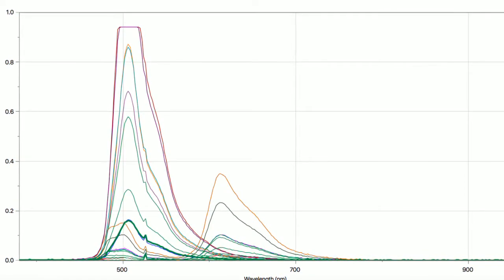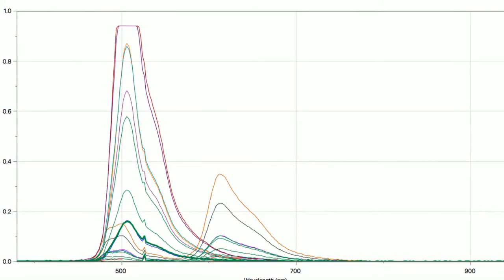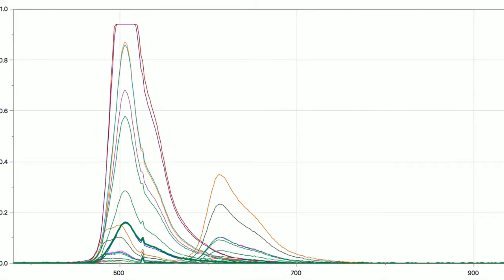The green had the highest intensity peak, and that is why it died first, as it emitted energy quicker. The mixed, when the intensity of both peaks were added together, had the second highest intensity, and the red had the lowest intensity peak, and therefore used energy at the slowest rate, and died last.